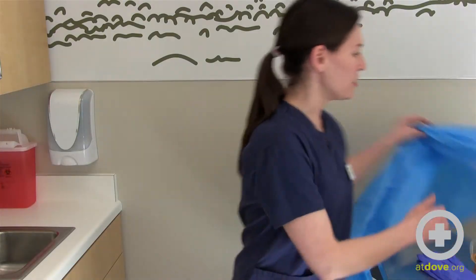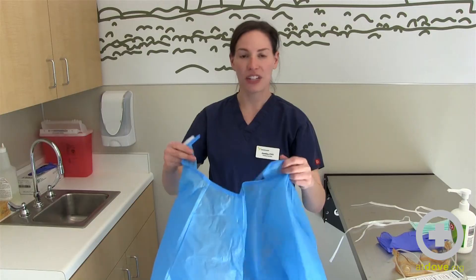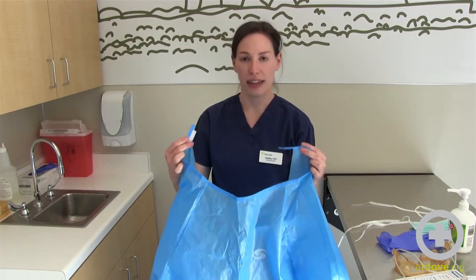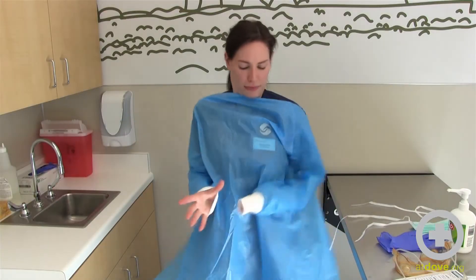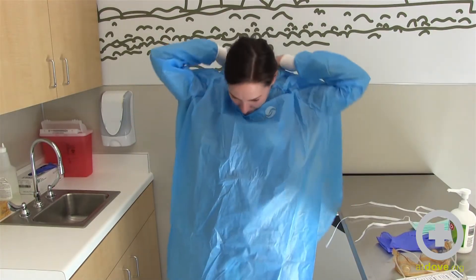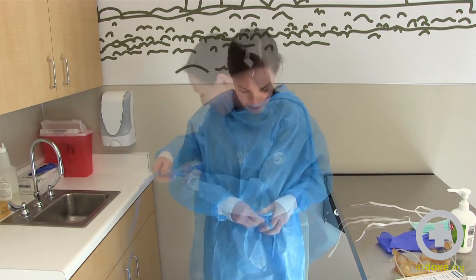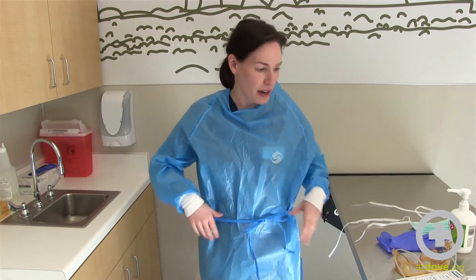So first they say to put your gown on. Most if not all gowns should have some kind of tie or velcro at the top, so you'll want to make sure that you tie or velcro your gown at the neck and then at the waist.